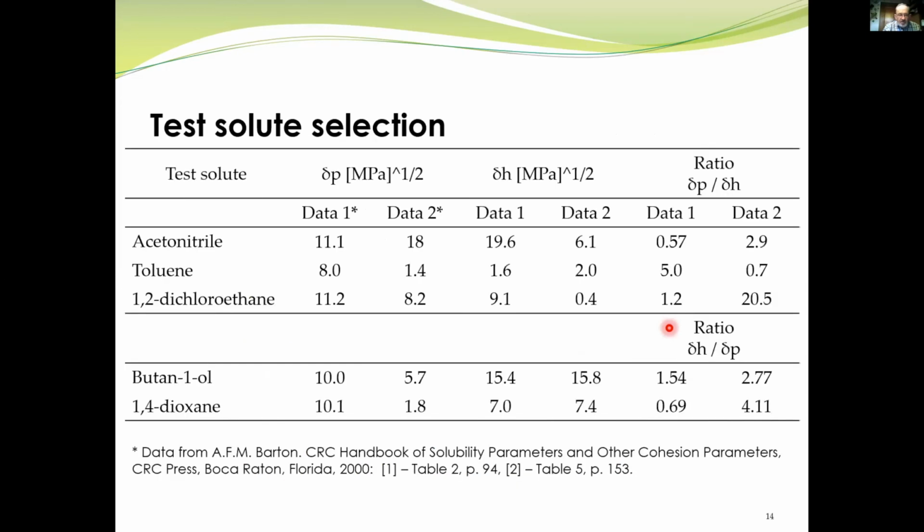selection of solvents, because when you like to use the data from the literature, you can find very strange information. For example, for acetonitrile, from one source you obtain one value, from another also different, and there is a problem, and wrong selection may lead to erroneous results.